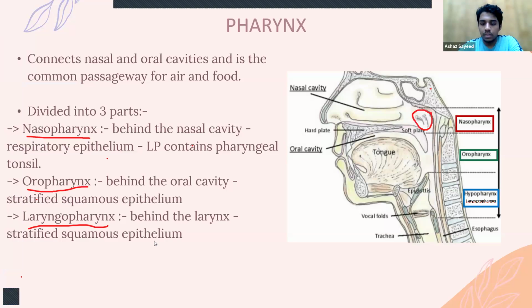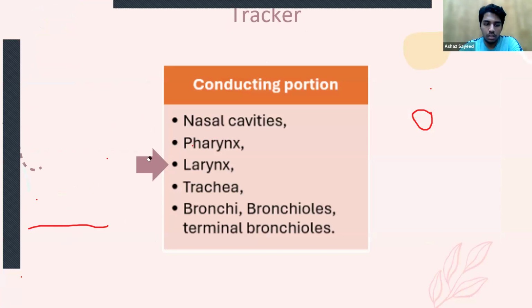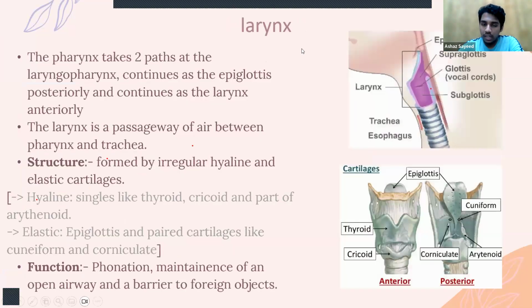So now we are moving on to the larynx. The larynx. So we talked about the pharynx.